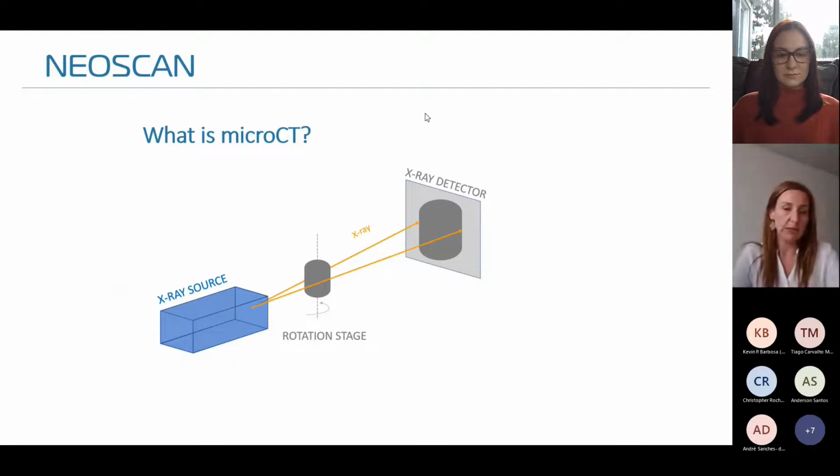In MicroCT, we use an X-ray source which will emit X-rays. We have a sample which can either transmit these X-rays or partially absorb them. And the remaining part of the X-rays, which will have the capability to go through the sample, that is what will be detected by the X-ray detector. As such, this setup seems very similar to radiography, something you might know from hospital when you end up there with a broken bone, or the security checkpoints at the airport.